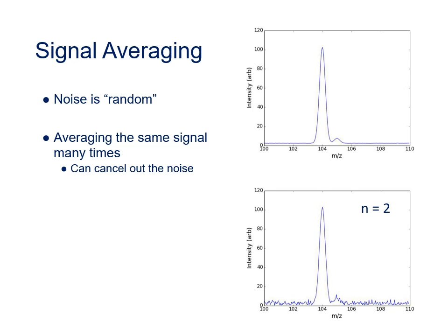But if I recorded two spectra and then averaged them together, now you can see the little peak has become slightly clearer. If I average 5 spectra, then that small peak becomes clearer still. And if I was to record 10, 20, 50, or 100 spectra and average those, you can see that the quality of the signal gets better and better.